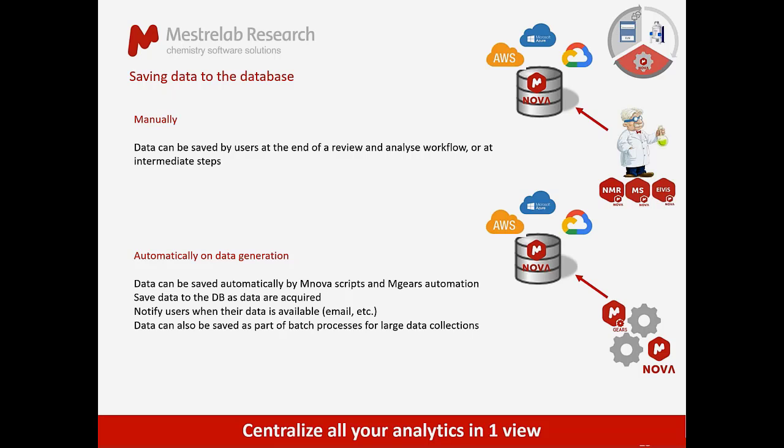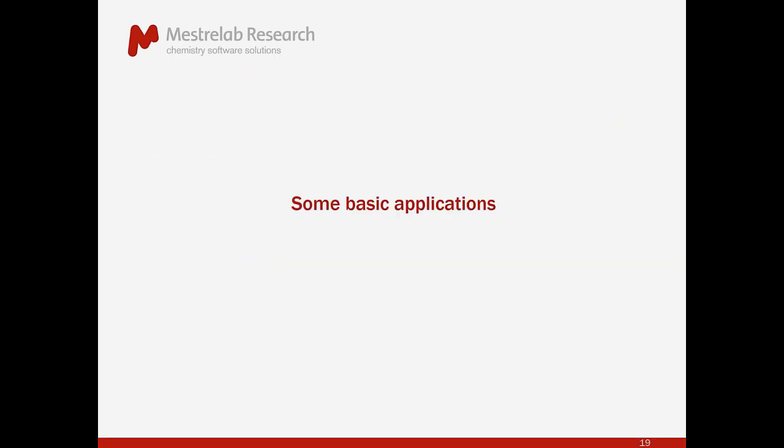And this is important because typically the most annoying thing about a database environment is that on day one, you don't have any data in it. So it's not very valuable. But if you, for example, have many thousands of analytical data, either in Mnova format or even in raw format, which you have acquired over the years, you could fully automatically populate the database with them, which means that from today, you could potentially be searching and getting a lot of value from maybe running queries and finding things that you did or somebody else did 5 or 6 years ago in your organization. Okay, so that automation I think is also very important.